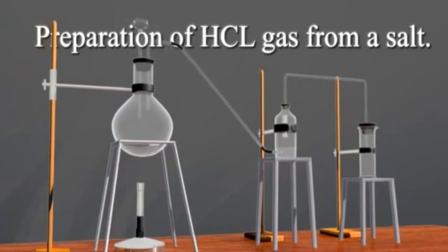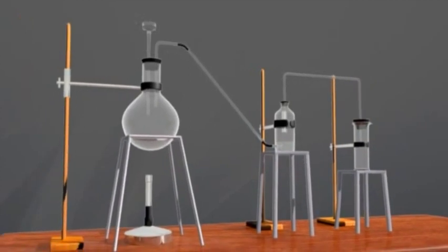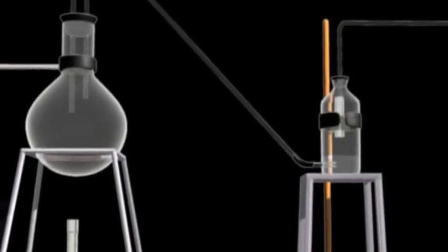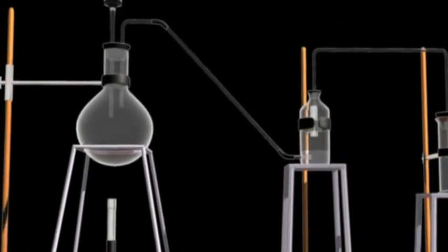In laboratory, hydrogen chloride gas can be prepared by reaction of concentrated sulfuric acid on sodium chloride.